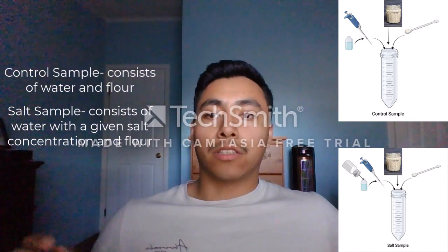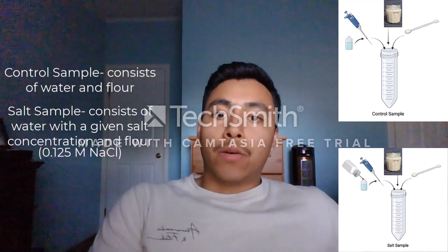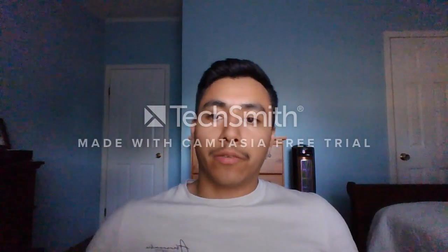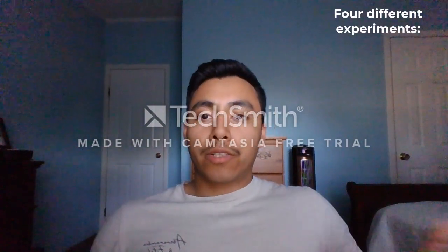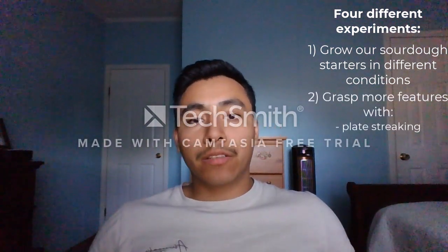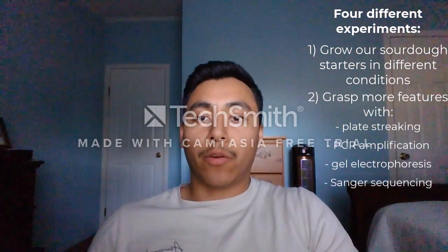We selected the sodium chloride concentration with a molarity of 0.125. We had the lowest concentration out of all the pairs, with the highest concentration being 1.5. We had four different experiments to, one, grow our sourdough starters in different conditions, and two, grasp more features with plate streaking, PCR amplification, gel electrophoresis, Sanger sequencing, and automated DNA sequencers.